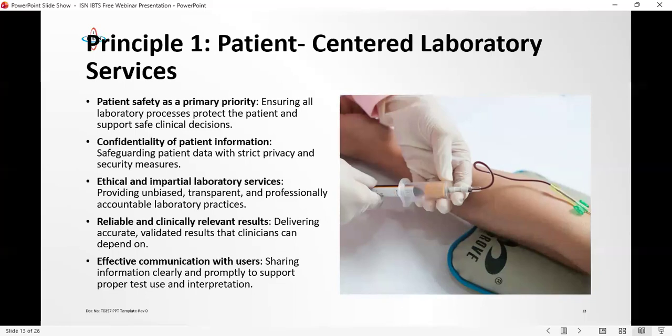When we implement this good laboratory practice, the ISO 15189 requirement is effective communication with users. If your result is not going to be available at a certain time, do not keep quiet and try to troubleshoot. Communicate first. Do you have a turnaround time for your results? Those results, are they going to be available at the time? Scientists must communicate with the phlebotomist because they are the front line. Or if you have a front desk, communicate with them that this is what is happening.